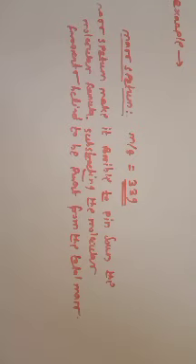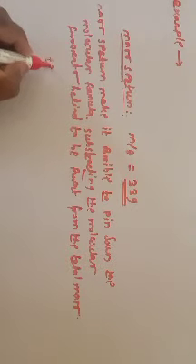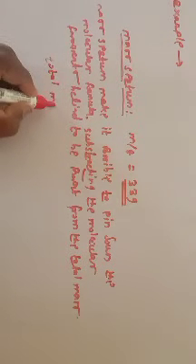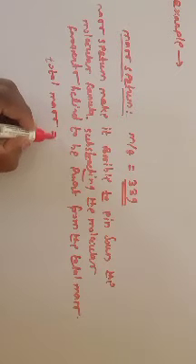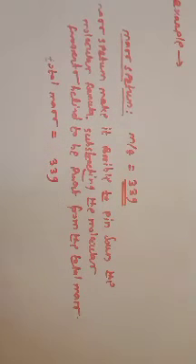These fragments we subtract from the whole mass, that is from 339. The total mass of the product is 339.